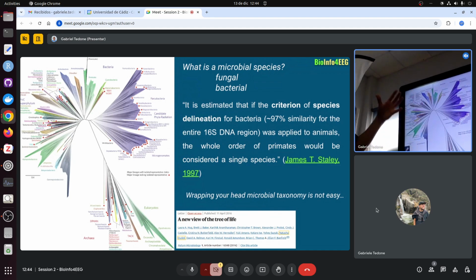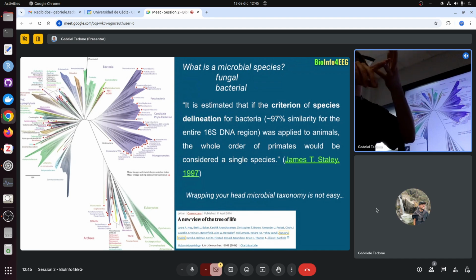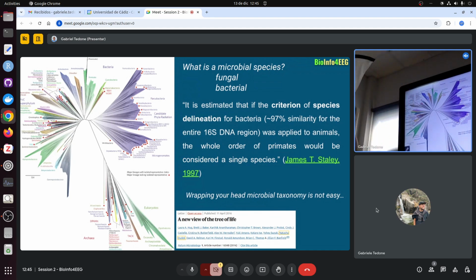So we have to understand the limitations also of the metabarcoding technology. We cannot assess the species resolution. All the experts nowadays tell you, unless you sequence the full length 16S operon, or you do multiple locus sequencing, meaning you sequence from the same sample the 16S, the 18S, and some other gene, you will not get species level resolution for bacteria, because all of these are bacteria.